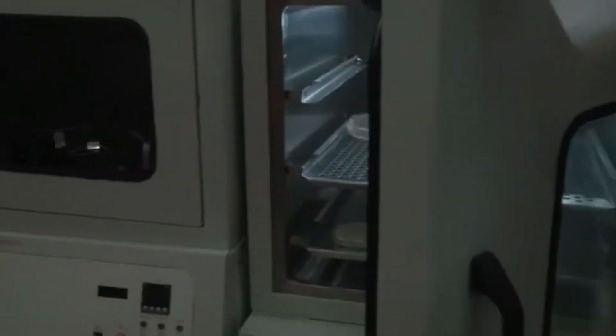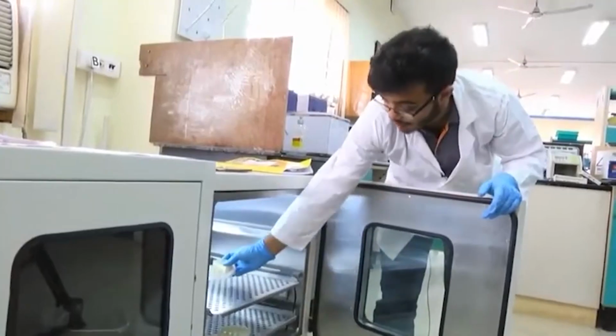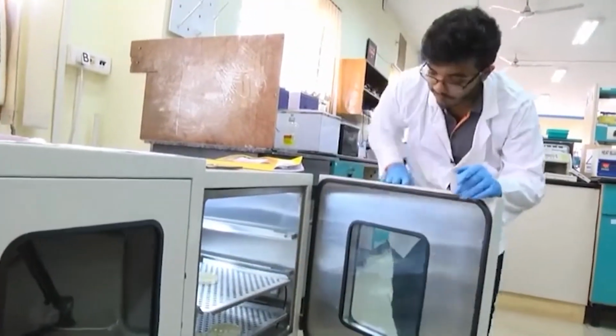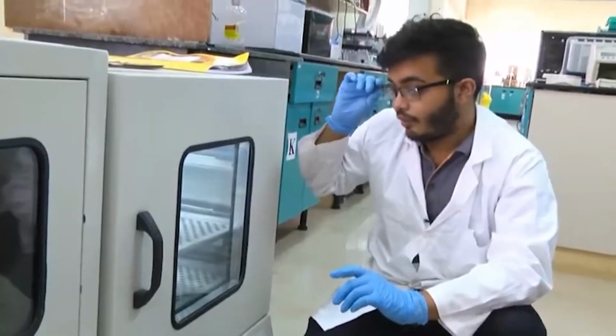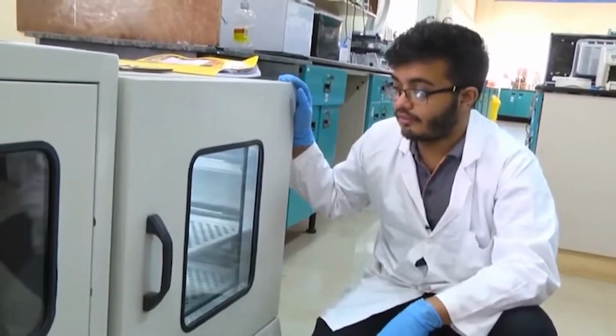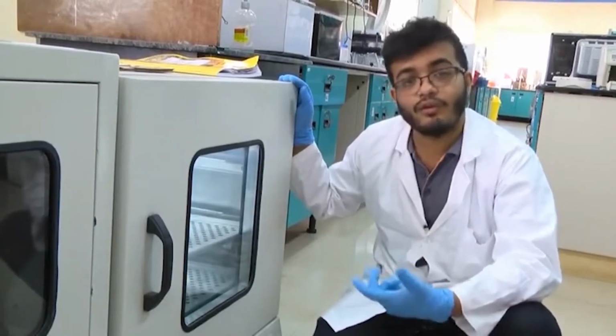and these two plates that we plated, I am now putting them inside, and so we will keep them here. We will leave them overnight, and tomorrow we will see if we have any colonies.